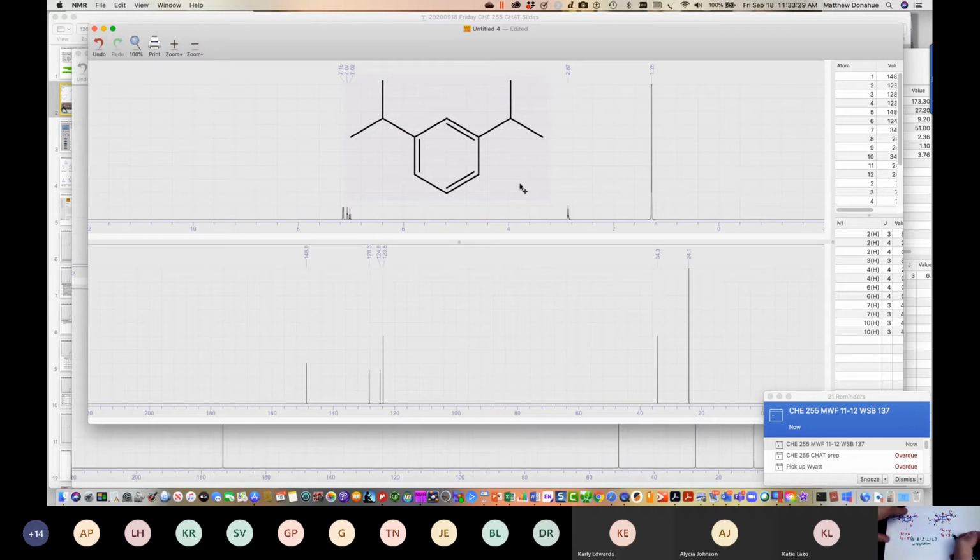So we have an early response here, 12 to 2 to 4. So 12 to 2 to 4. Again, it doesn't really matter what order we write those in, just as long as we're getting the correct numbers.